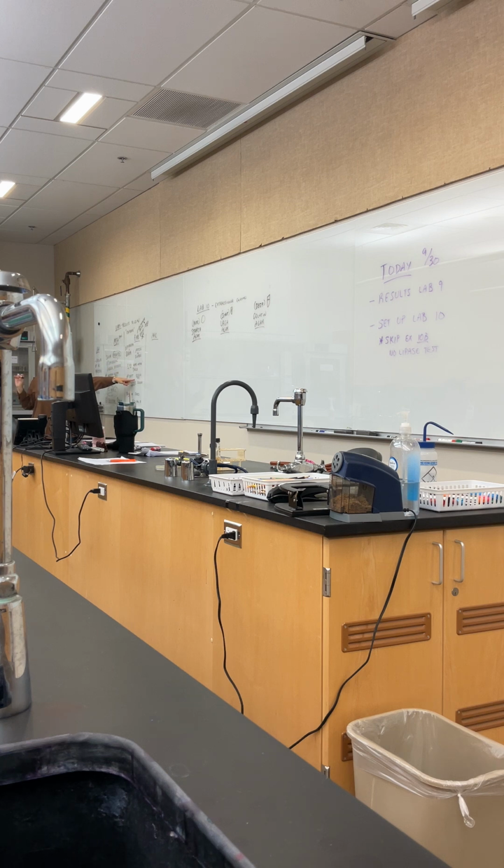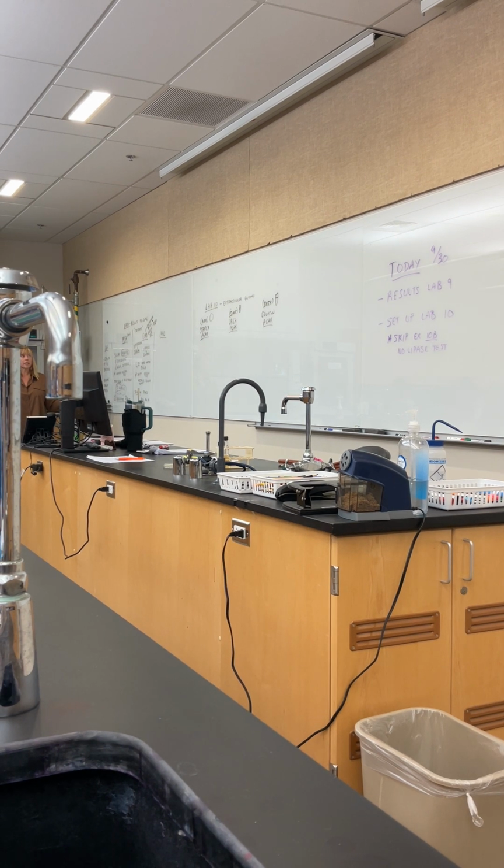That dye that we're using is also a pH indicator. So it's doing a double duty. Okay, yeah, so it's a pH shift and it's a dye. Yeah, good question. Okay, are we doing okay so far? I know it gets confusing, that's why we're going through these, we're spending some time.